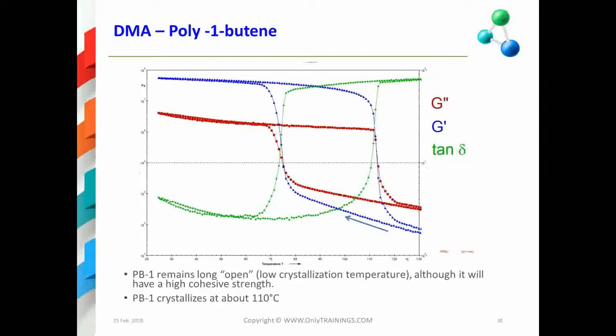So then this is the graph, the temperature sweep of such a material. And again, you see a big difference of those two lines. The crystallization happens at about 110 degrees. That's normal, but that's also interesting. This is a temperature of the first crystal structure.